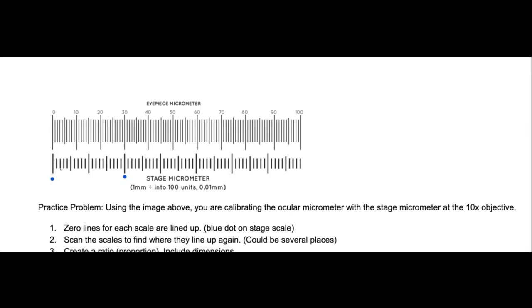tick marks. So the way rulers work is that these largest tick marks basically represent your largest full unit, and these sort of a little bit smaller tick marks represent half of a unit, and then there's 10 individual smaller units in one full unit. So the halfway represents 5 smaller units. So here 0.01 means between each tick mark there's 0.01 millimeters.